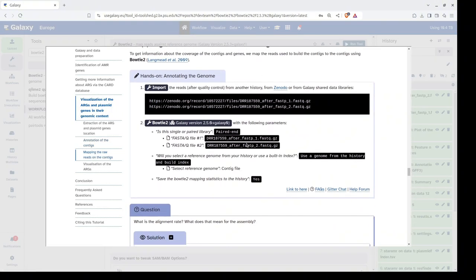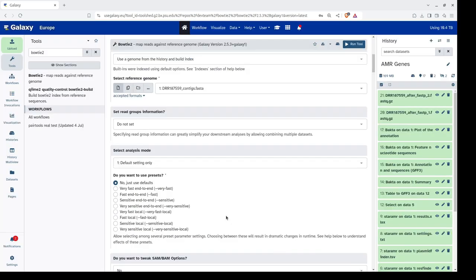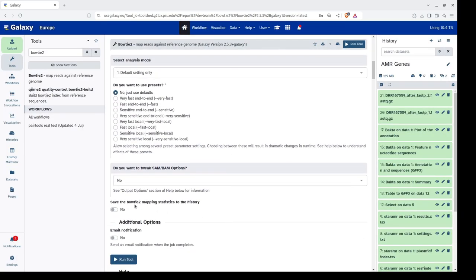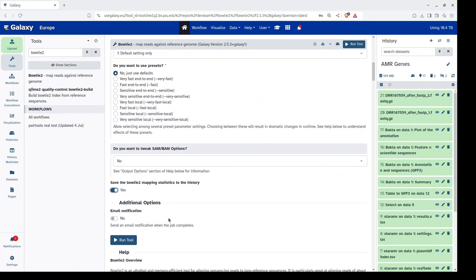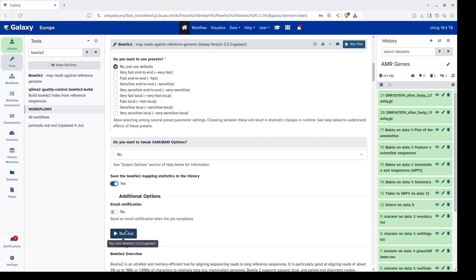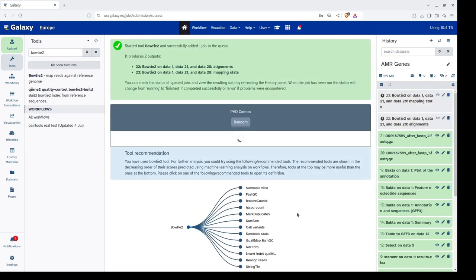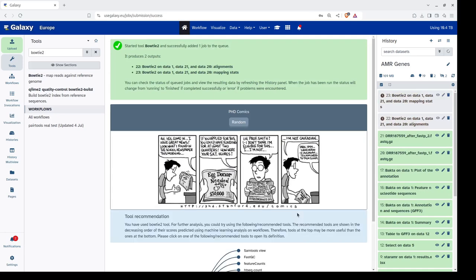Once all parameters are selected we double-check if anything was missed. We also need to save the Bowtie2 mapping statistics to history and toggle that option to yes. Then we click the Run Tool button. The Bowtie2 mapping may take some time, so we retrieve the results once mapping is completed.